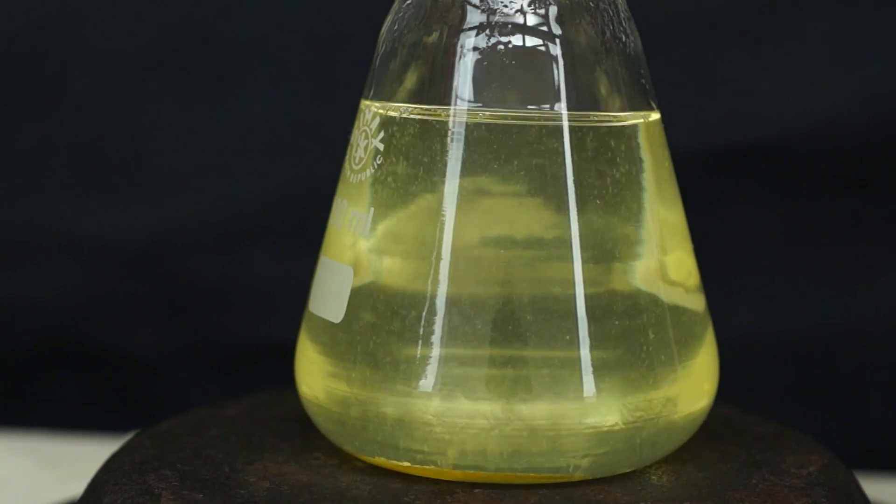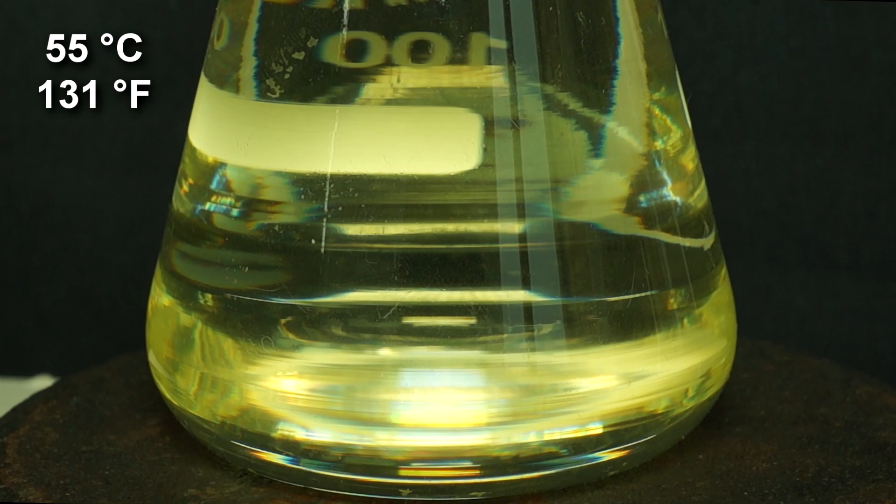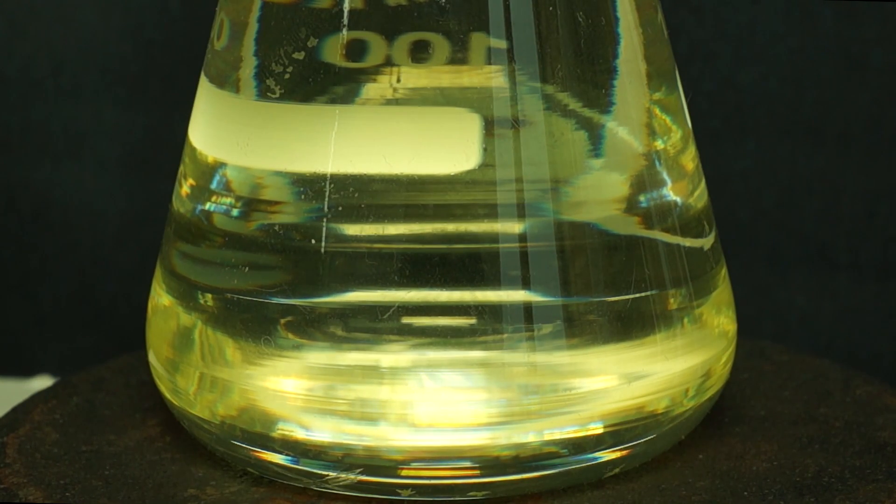After the mixture reaches 95 degrees Celsius, all the sulfur will completely dissolve in toluene. Upon reaching 55 degrees Celsius, yellow needle crystals of sulfur will begin to precipitate in the flask.